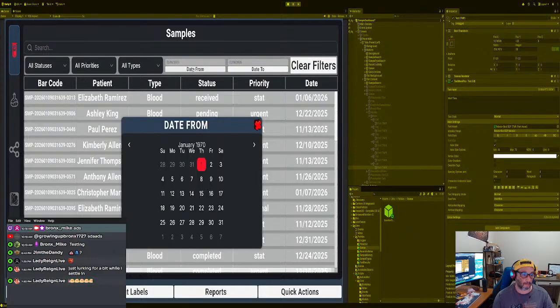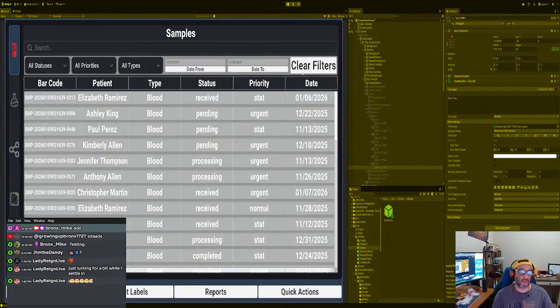Nope. 1969. Oh, no, this is gonna take a long time. We gotta figure out how to fix this stuff. So we got some modifications to make sure it's working. All right. We gotta go through that.